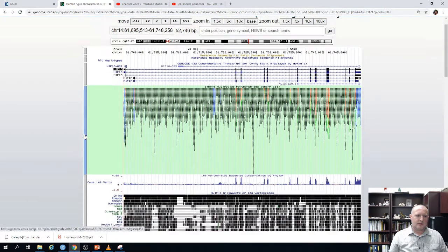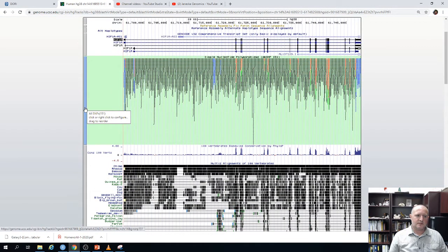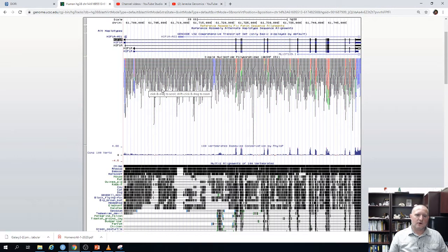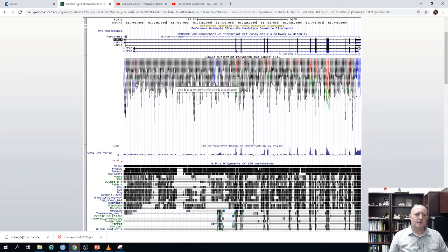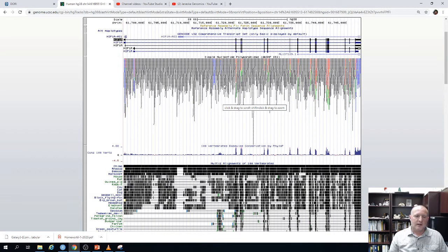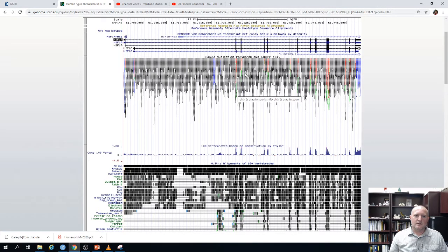The track below is the SNP track from version 151. This shows all the single nucleotide polymorphisms described in the human genome across many populations. Notice there are hundreds and hundreds of variants described in different individuals and populations. Most of these variants are actually non-functional and have no phenotypic effects. Variants shown in black are in introns; colored variants — red or green — are in exons.